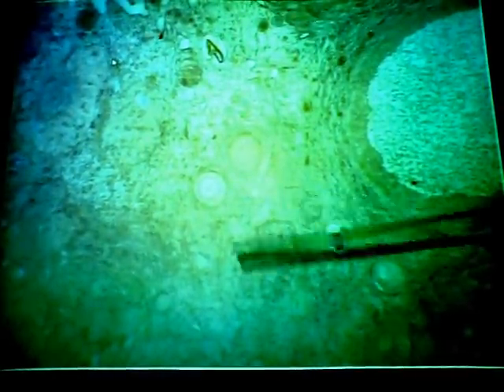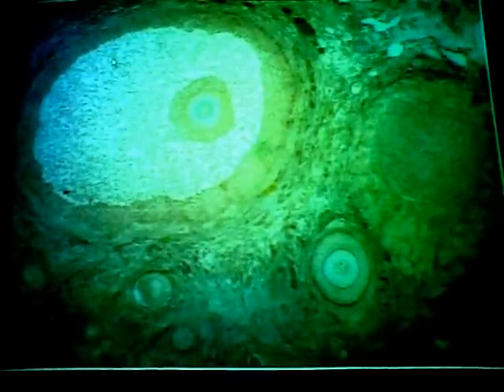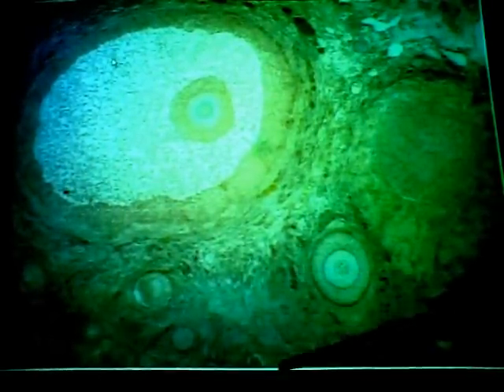And you go across here, and you can see there are even more. Here's another primary follicle. Down here, of course, is your primordial. See the difference in size. But again, when you've got that fluid filled cavity, you're looking at a secondary. There's another primary. These are primordial down here again. And here's another, that's the antrum, another secondary follicle. Another one, another. Questions?